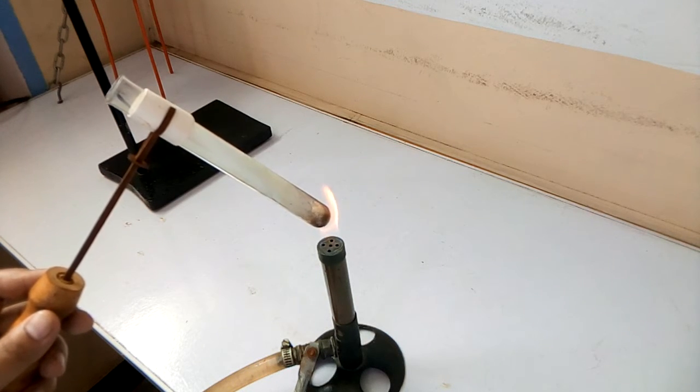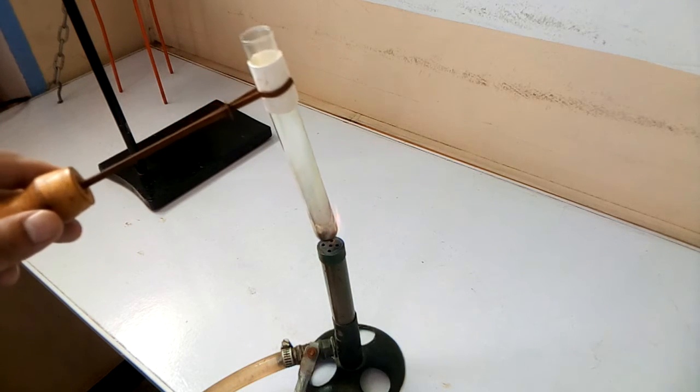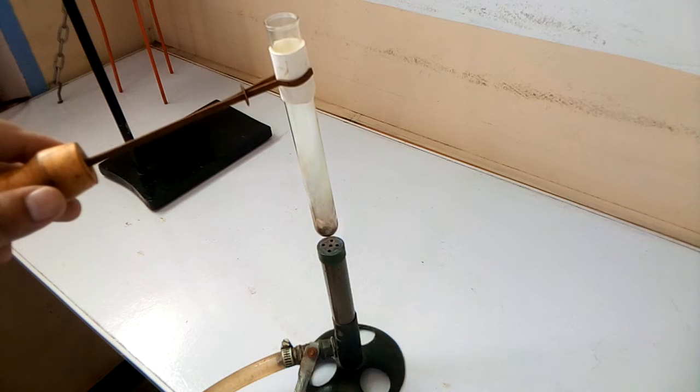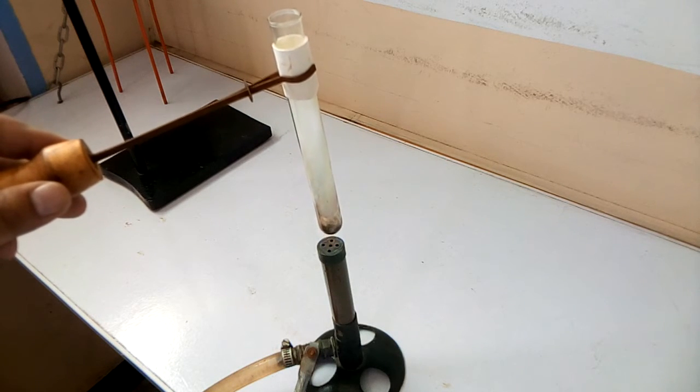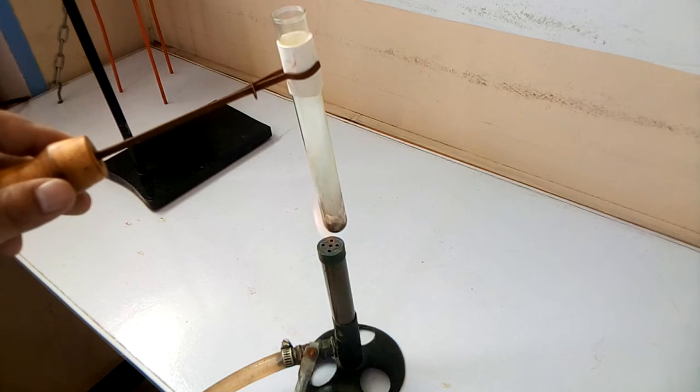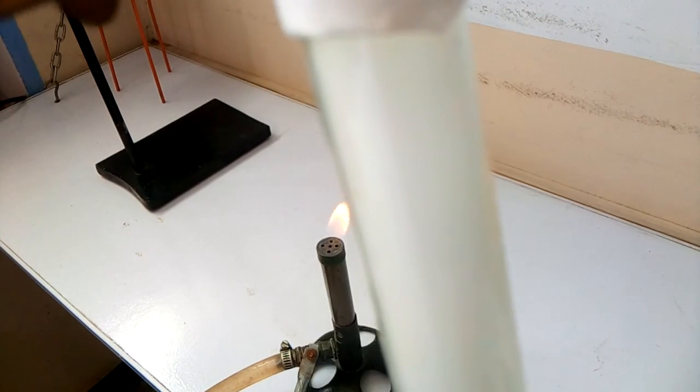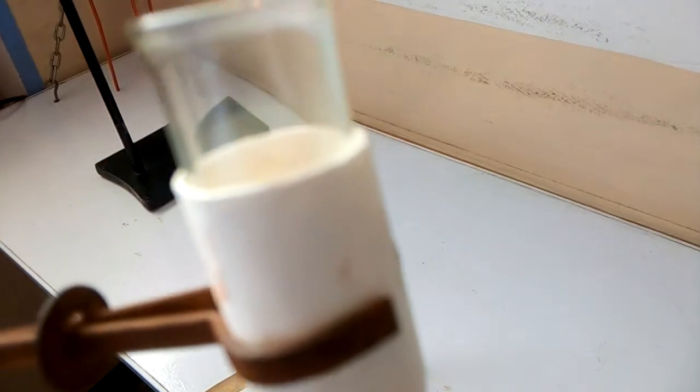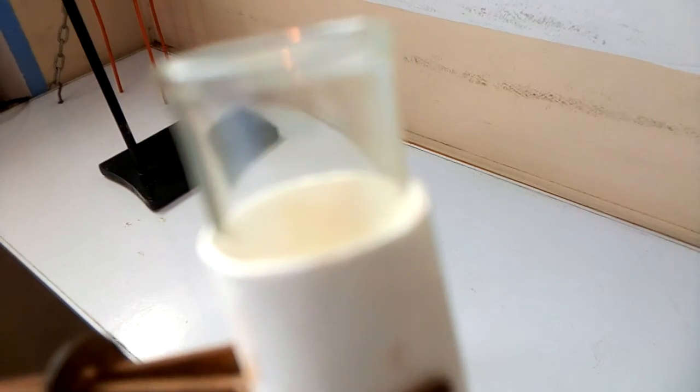White colored fumes can be seen easily inside the test tube. You can see a close-up of the white colored fumes inside the test tube. This is the empty end of the test tube.